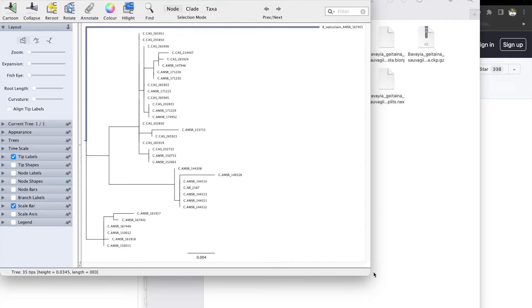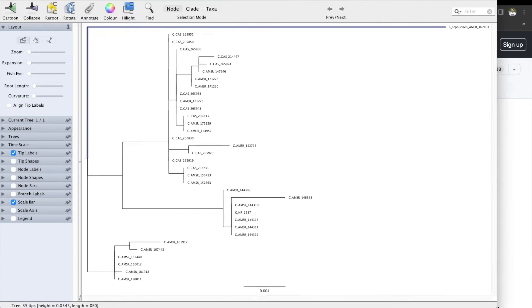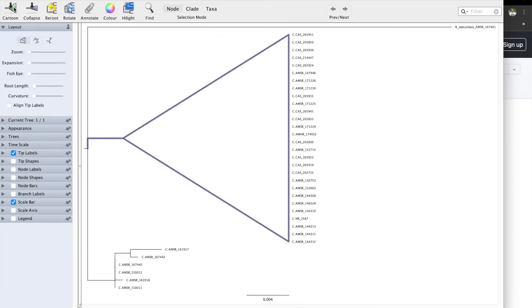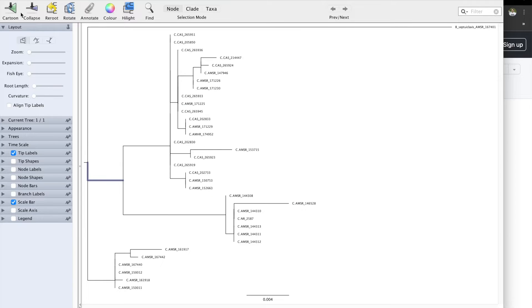Now we have the tree open. Let's take a look at a couple of options we have. First, start with the Cartoon. If you click on a node and click on Cartoon, it's going to turn it into a triangle, which is not very useful. Collapse can be useful sometimes if you want to get rid of some of the nodes, but we're not going to use this.